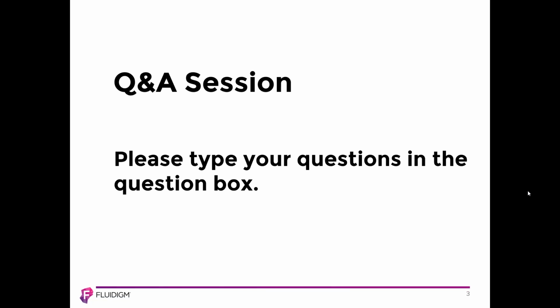That's a good question. The best way to answer is to say it depends on your question. We have some researchers who tend to do their clustering separately and then to identify their groups, their subgroups that way, and then come and compare them to their other subsets. We have others who tend to put them all together. I think it ultimately depends on your question and what you're trying to answer.